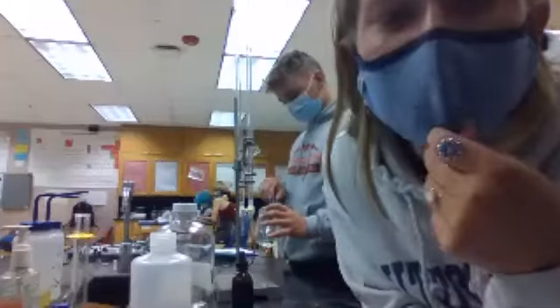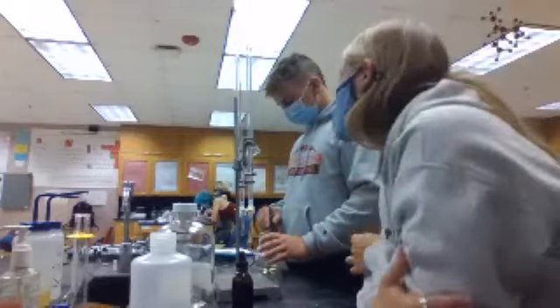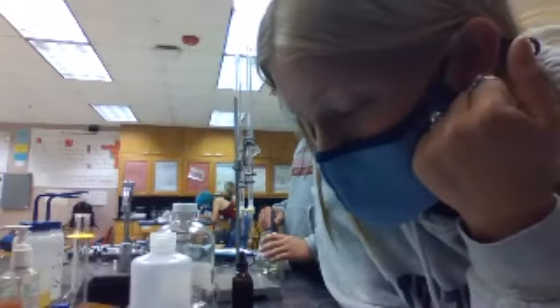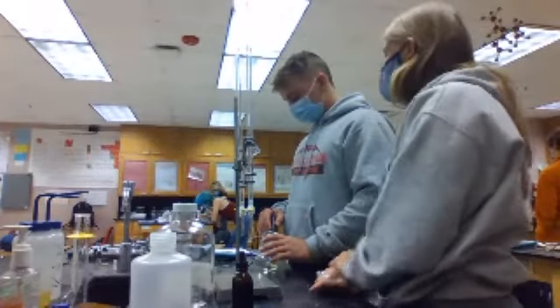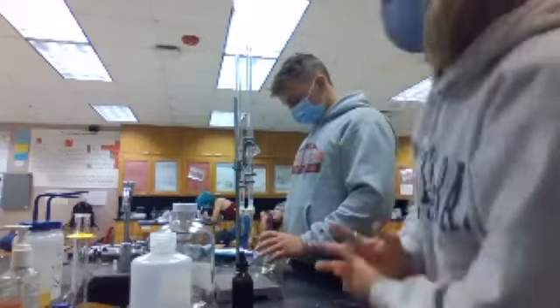Okay, it's starting to get blue when it touches it, but it's not fully blue yet. We're at about 37.15 milliliters, so it's a little past what we predicted, but it's okay. He said just hold off. This might have been the color change because it went up. But it should be at 7. Does the pH need to get to 7? Yes. When it officially turns blue, we're gonna take the pH and it should be around 7. Right now it's at like 4 something. So it went up a lot.